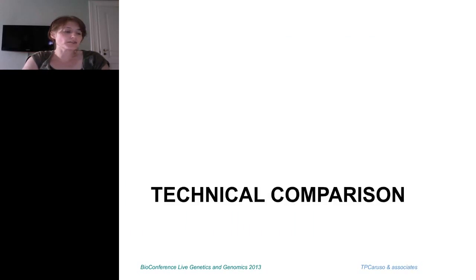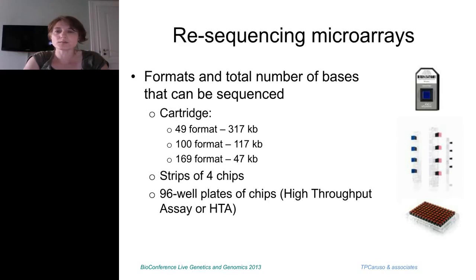Now I'll go into technical comparison of the 2 platforms. So just to start off with the sequencing microarrays, what they are and how they work. The sequencing microarrays are based on the Affymetrix technology. So a lot of you are familiar with it, and those that aren't, I'll explain a little bit more about it.